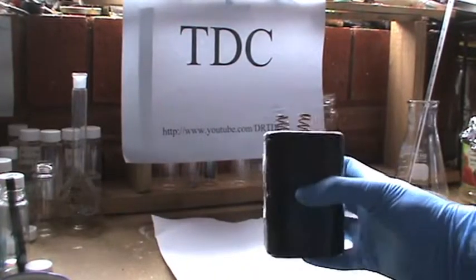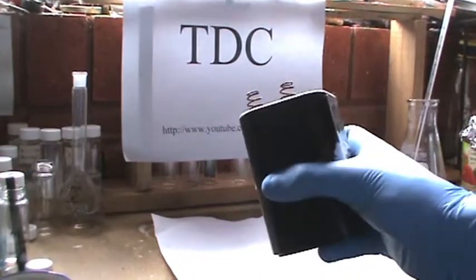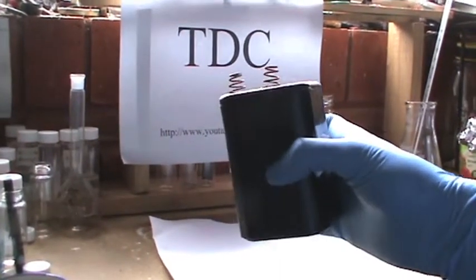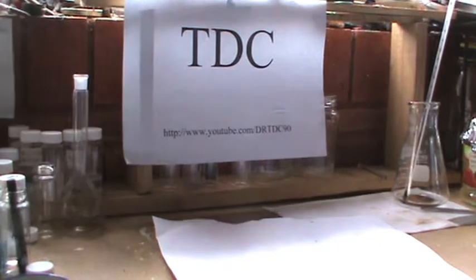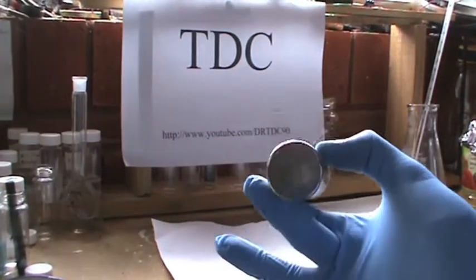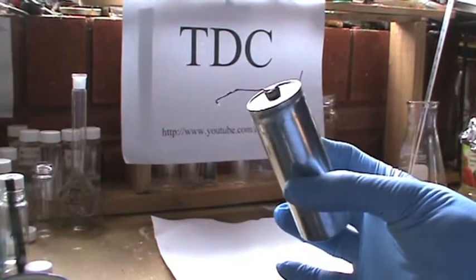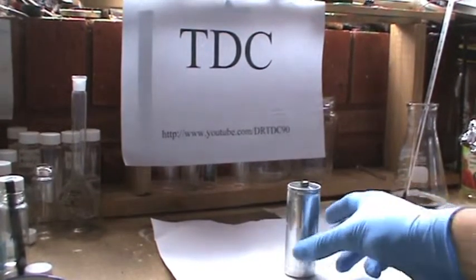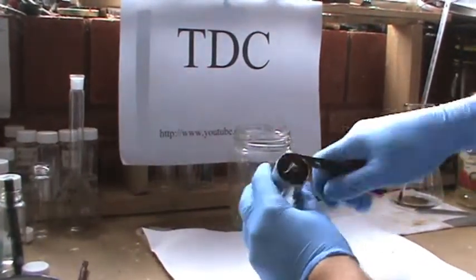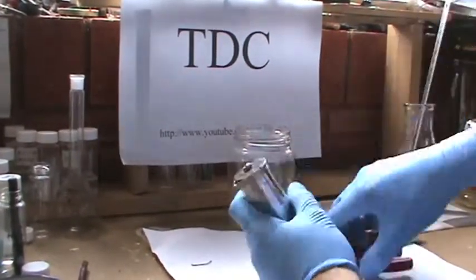First of all we need to obtain a graphite electrode from a carbon-zinc dry cell. In this case we have a 6-volt carbon-zinc dry cell. Cut open the top of the battery and you will see that there are four separate cells connected together. Obtain one of these and dismantle it to retrieve the graphite rod. There are a few videos on YouTube describing these cells so I'll skip over this part.